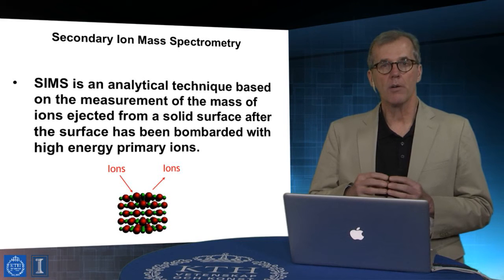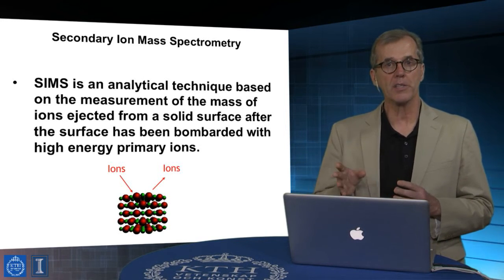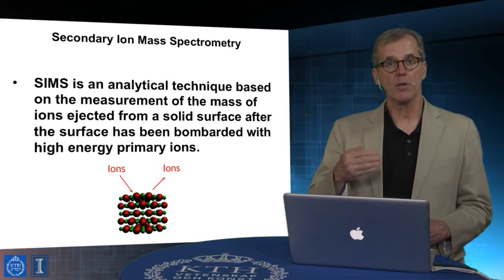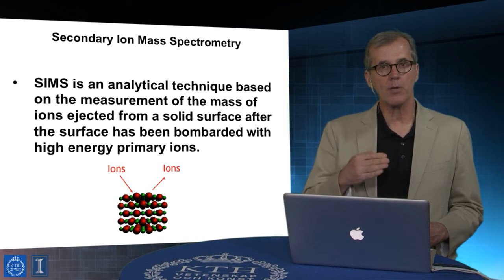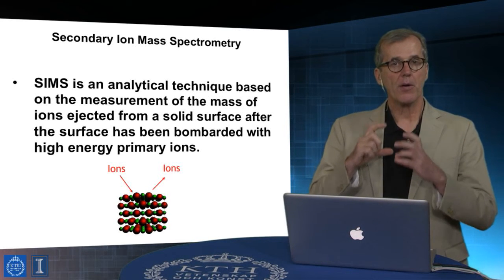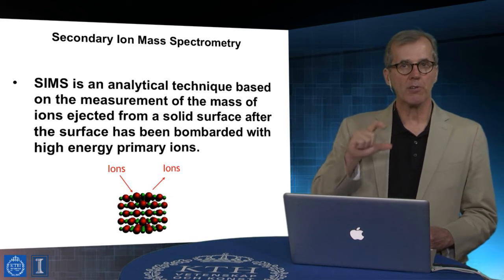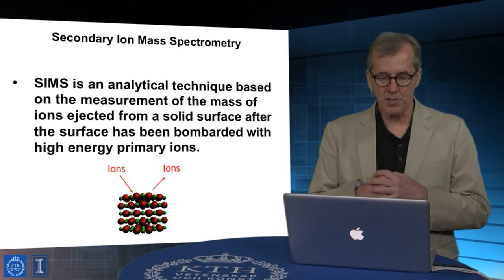So we mentioned in previous lectures the use of ion beams as a way of milling a sample to remove material in order to measure spectra of clean surfaces, or to abrade material to acquire spectra of interfaces that are buried within a material, to drill into a material and measure surface by surface its elemental and compositional characteristics.